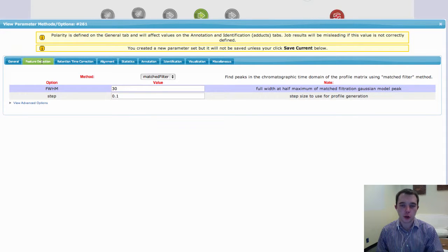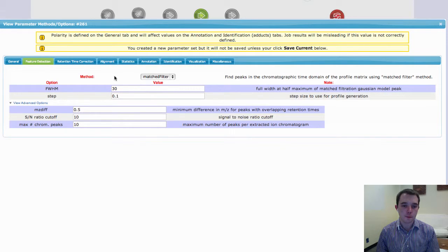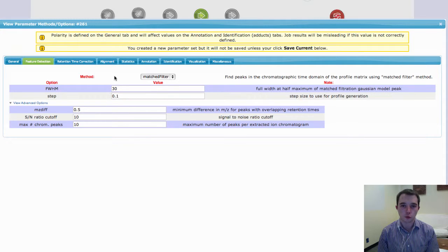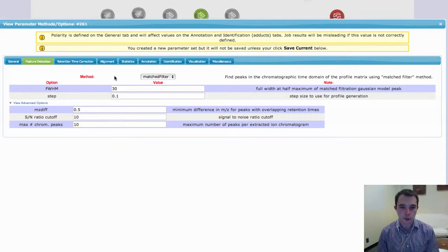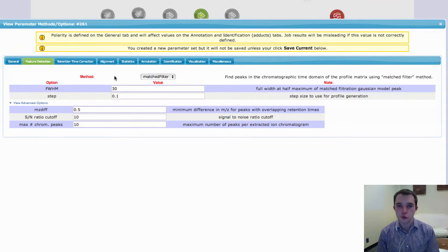Now I'm just going to touch on quickly here two of the very big choices that you have to make right at the beginning, which will greatly affect your different data sets, and that is peak detection. XCMS Online has two different algorithms for peak detection.